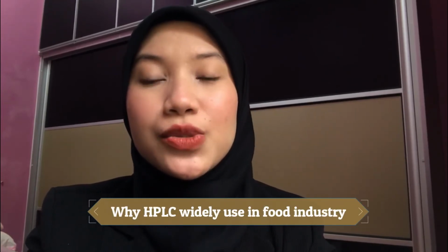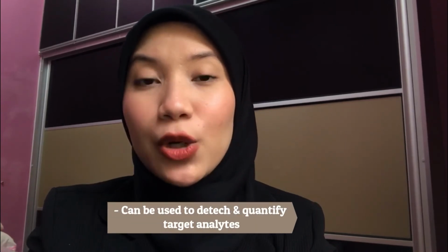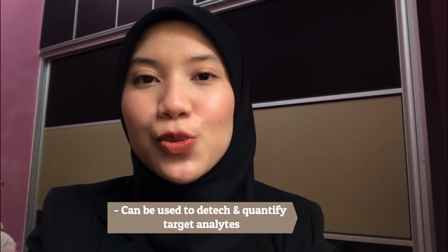Next, I will explain why HPLC is widely used in the food industry. This is because it can be used to detect and quantify the target analytes to monitor the levels of pesticides on food products. This is to keep them in line with the government limits and to protect the consumers. Next, I will talk about how HPLC techniques help the development and analysis of products in the food industry.